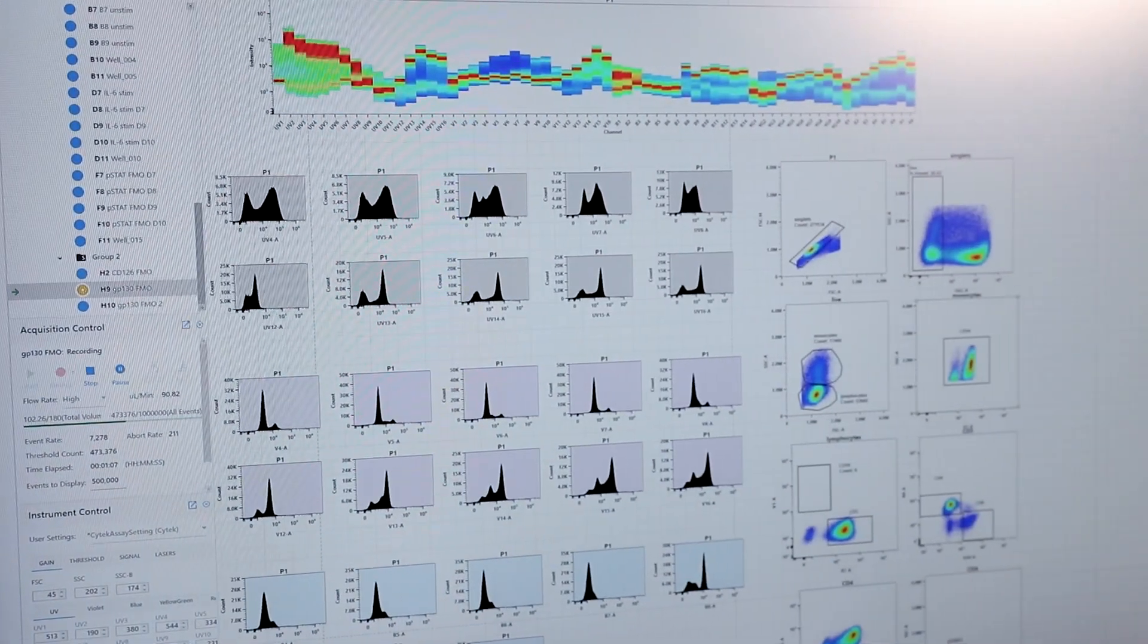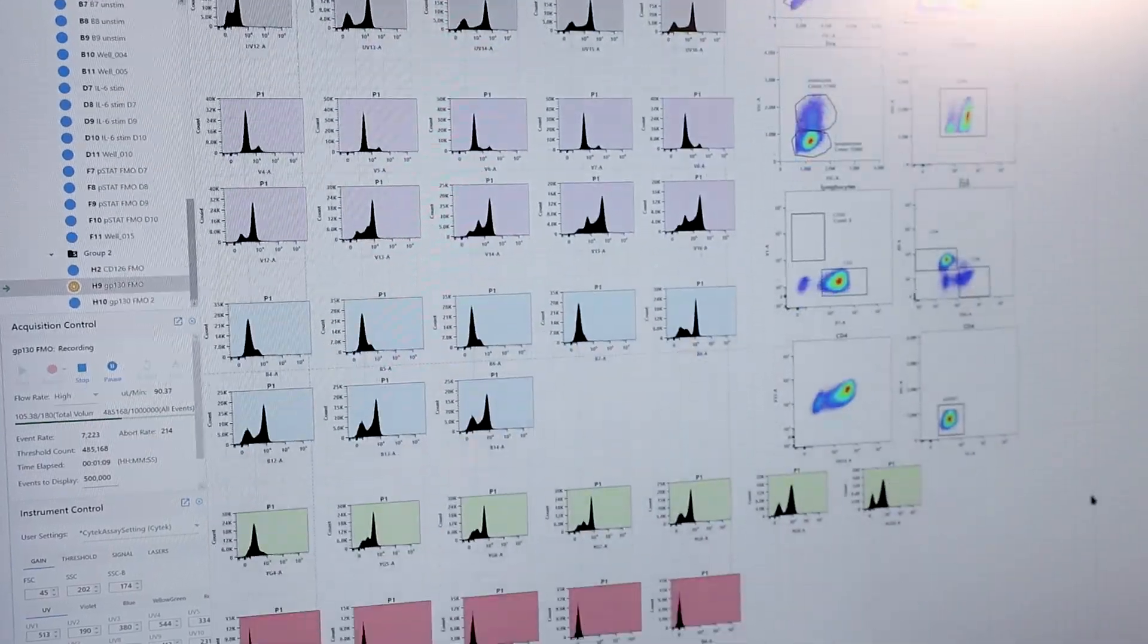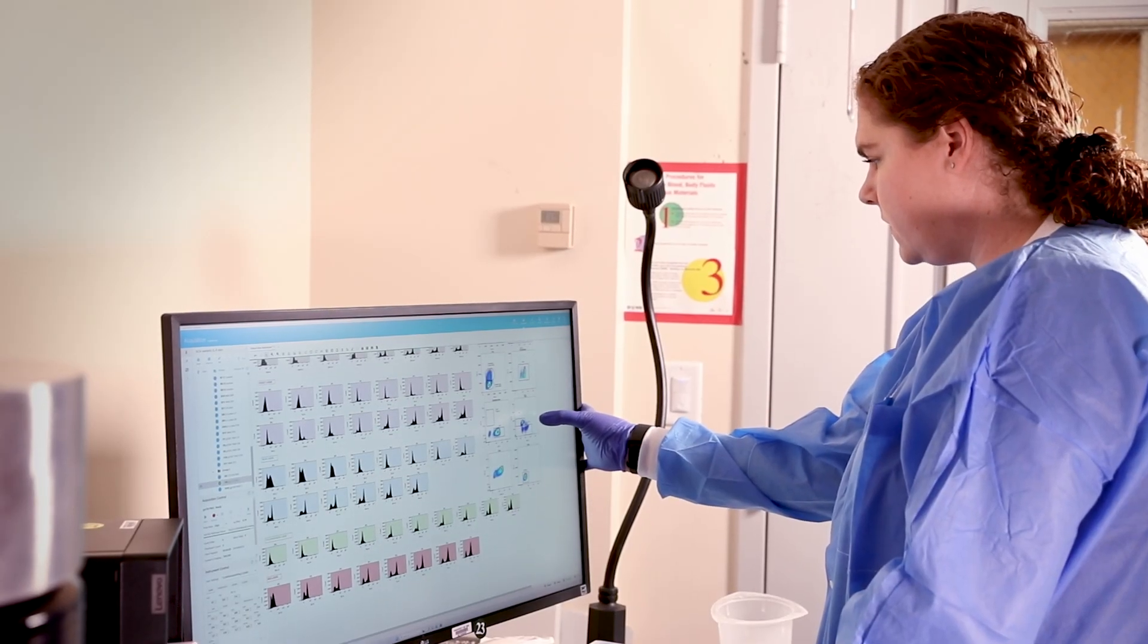Now we look at the entire spectrum, and it enables us to use more fluorescent tags. We can do up to 50 tags at the same time.